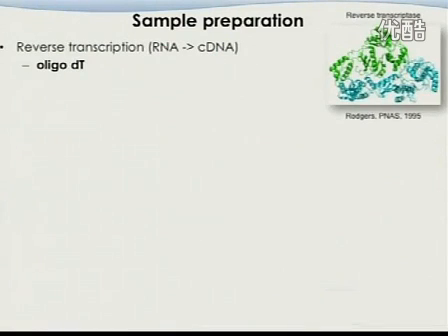And the third consideration, which is related to the ribosome depletion, is the reverse transcription part, which means from RNA to cDNA. How are we going to do that? So the point here is our sequencers, they are second generation sequencing, they are DNA sequencers. They do not sequence RNA. Although people are working on protocols to do direct RNA sequencing, it's not mature enough yet.